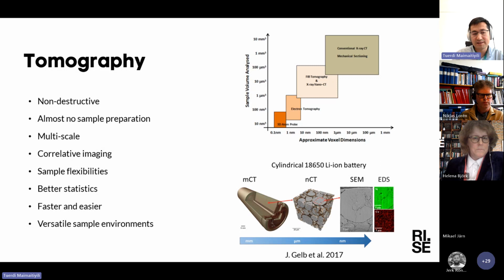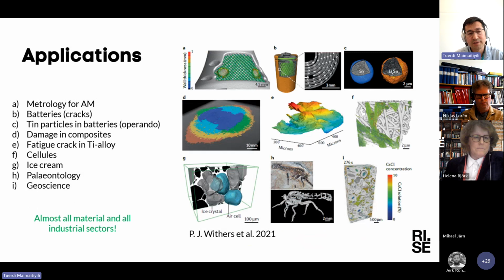And last but not least, the sample environment of the tomography measurement is a big plus. In contrast to other techniques, there is no vacuum, which makes sample environment development much faster and easier. Because of all those advantages, CT became quite popular in various sectors.